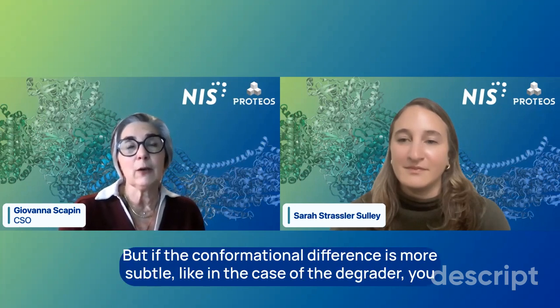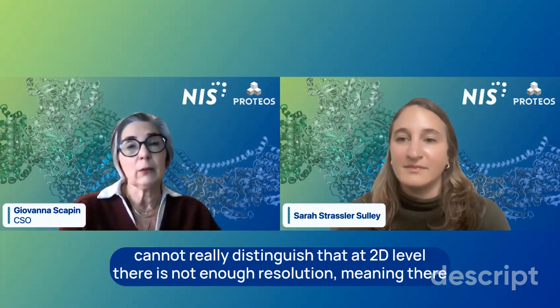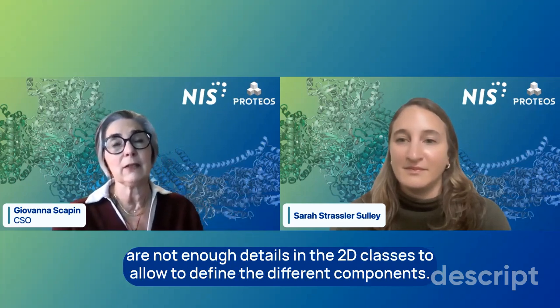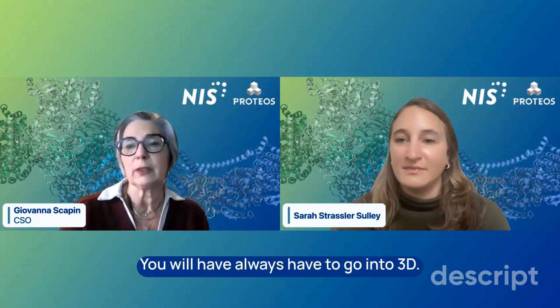But if the conformational difference is more subtle, like in the case of the degrader, you cannot really distinguish that at 2D level. There is not enough resolution, meaning there are not enough details in the 2D classes to allow you to define the different components. You will always have to go into 3D.